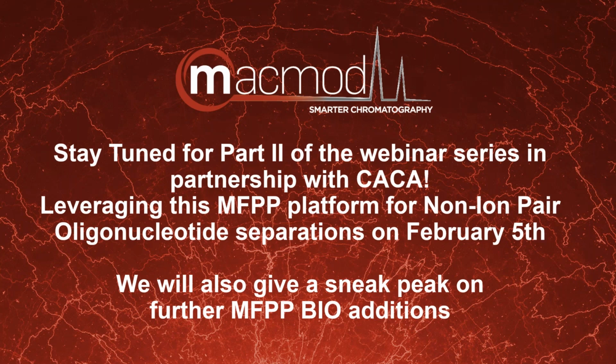So what's the most popular starting point for method development using this new column? I was trained in chromatography by a guy who liked to screen phase chemistries. In pharma the budgets can be a bit bigger than in mid-size or small-size pharma, or even the folks in pharma support teams. So we always promote screening multiple modes of interaction at the same time.